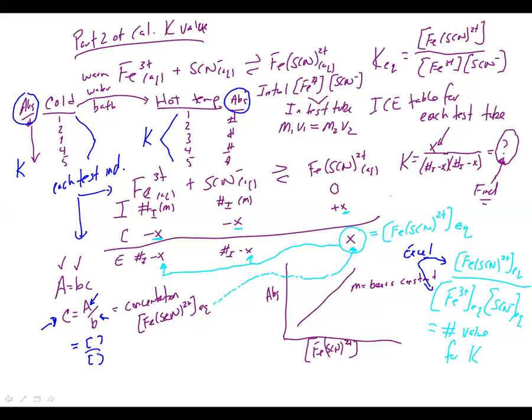Obviously, you'll also need to include in your data section, in this case, your graph, your standard curve that's been properly labeled, that shows your equation and all that good stuff. So you'll have to show that kind of stuff as well. Any questions on any part of the experiment?